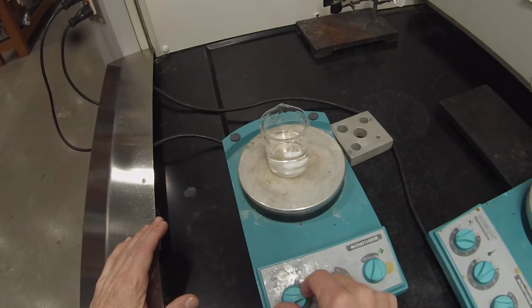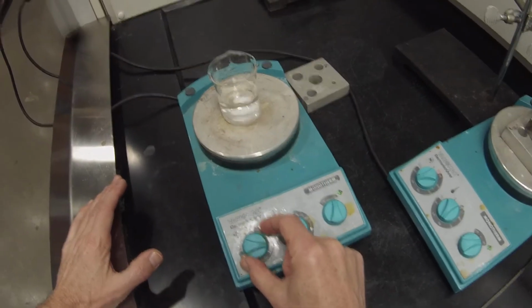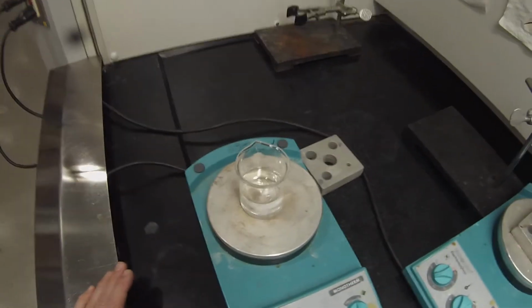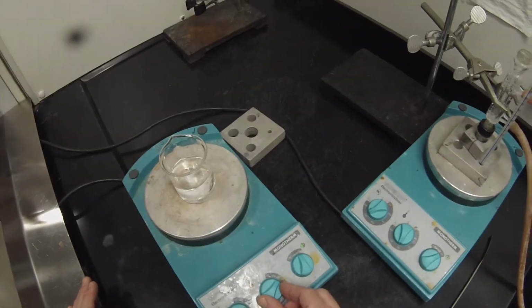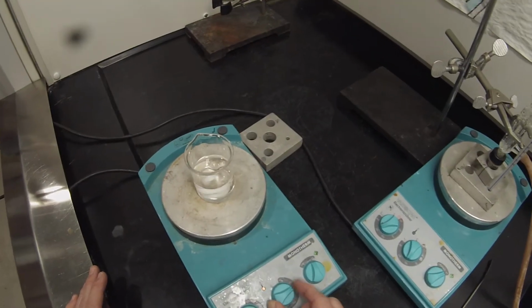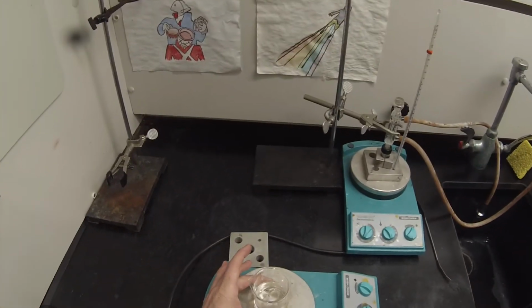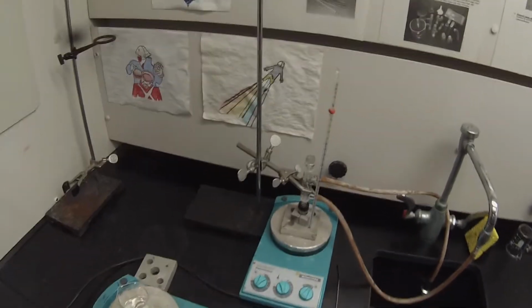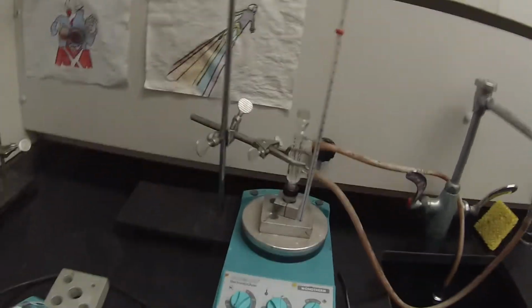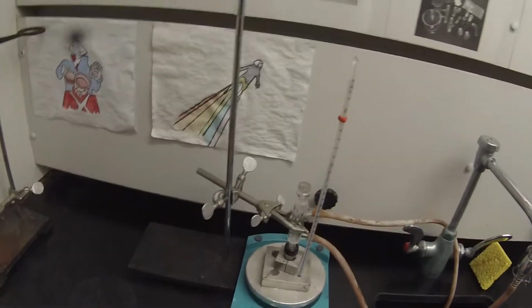I'm going to turn on this stirring hot plate, set that spinner at about halfway between the 300 and the 450, and I'm going to crank this up to halfway between 100 and 150. That should get me to the boiling point. We'll just let that start to heat. You can ignore that. That's the unknown alcohol lab. I'm doing these two labs simultaneously. That's just cranking away in the background, refluxing for an hour.